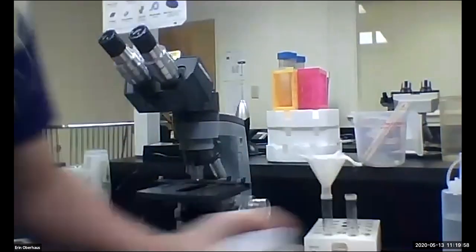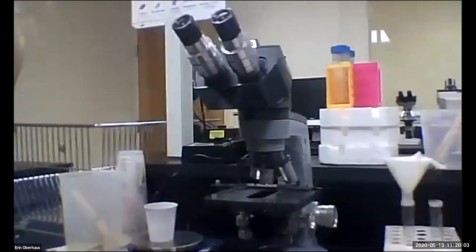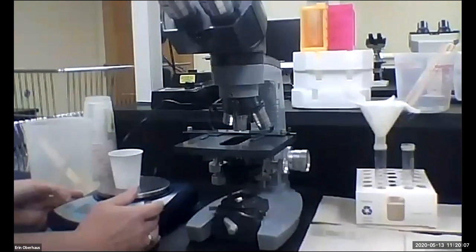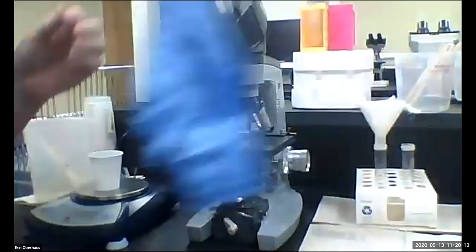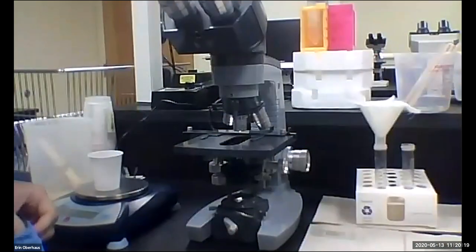So I'm going to, let me know if I need to adjust. It's kind of hard to do. So I'm going to put my cup on. I'm going to account for the weight of the cup. I guess I'll be a good laboratory technician and wear gloves, even though I'm not scared of a little horse poop.